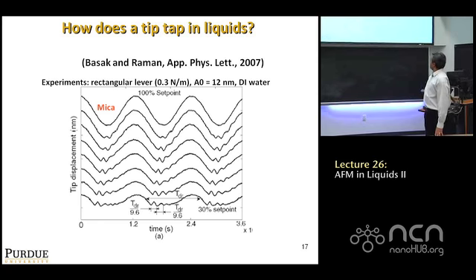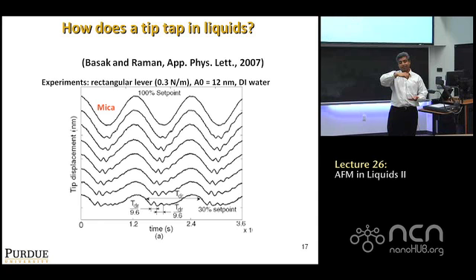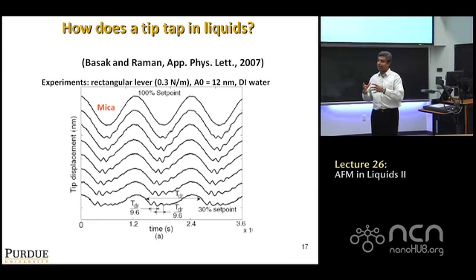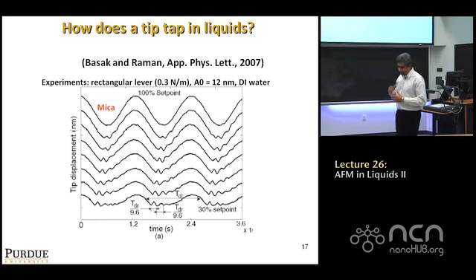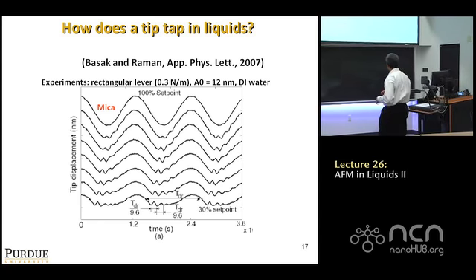And when he did an analysis of the time period of these little ripples, he found it was actually the second eigenmode of the cantilever that was excited each time you tap. Remember we've talked about the second eigenmode, it sort of was excited momentarily, like it twinkles and then it dies out. It's like ringing. So if you think of your cantilever as a glass, each time you tap, you make it ring, right? So that's exactly what was observed in this analysis, okay?